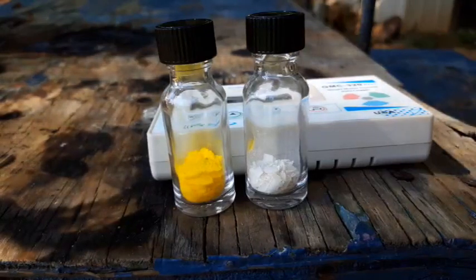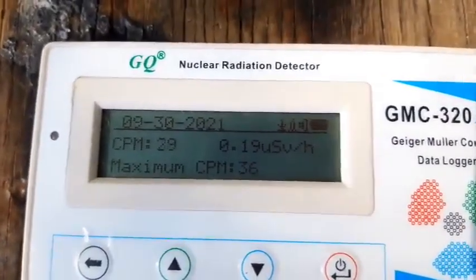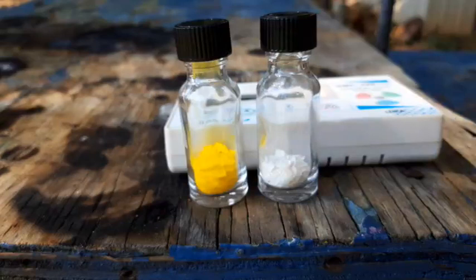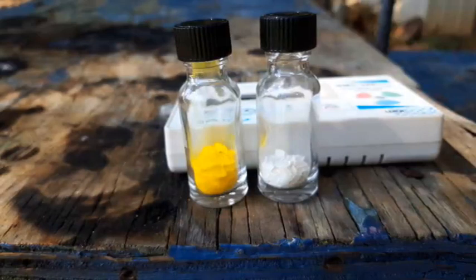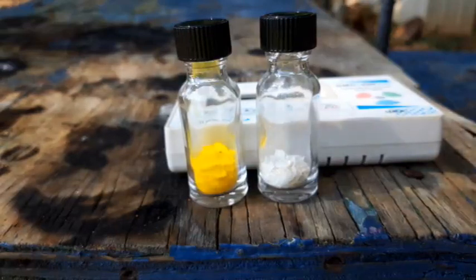The glass in these vials stops beta particles like you would not believe — it's just crazy. This has been sitting next to the uranyl acetylacetonate for a while and I'm getting about 30 counts per minute, which is very close to background. I was getting about 900 counts per minute off the uranyl acetylacetonate yesterday. Backyard Science 2000 sent me these vials — whatever kind of glass they're made out of, they really block a lot of radiation. Background here is usually about 25 to 30 counts per minute, so that's some pretty remarkable glass in those vials.